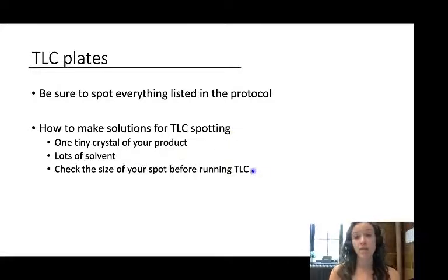Additionally, I recommend that everyone checks their TLC before even running it. After you spot your reactants and products, go ahead and look at your plate under the UV lamp, and you should be able to see whether or not you have a nice small spot or a rather large spot.